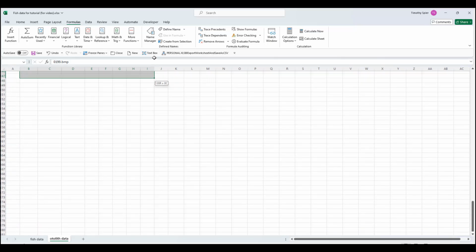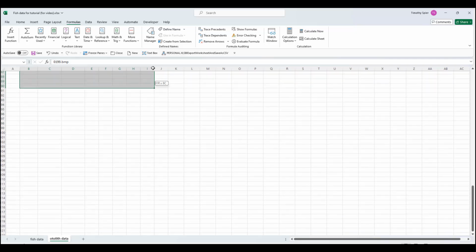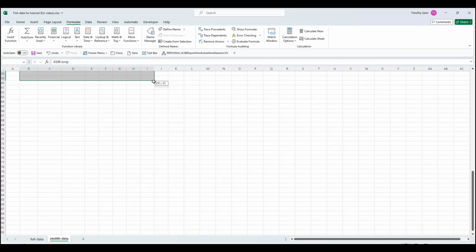Whoa, that went out of control. Wow, that went really fast. Come up here, okay, here.